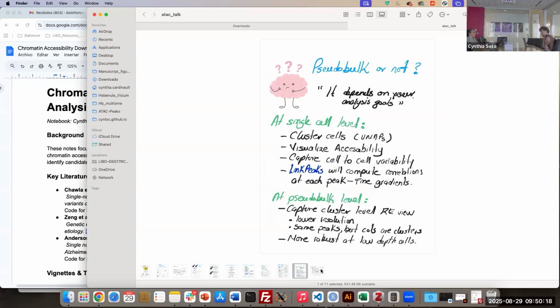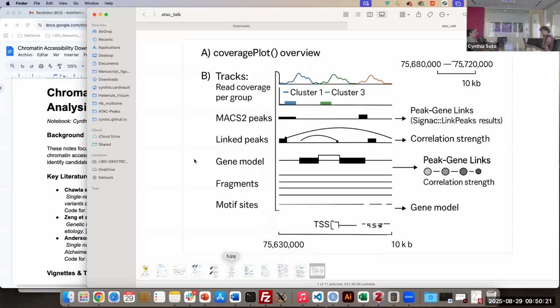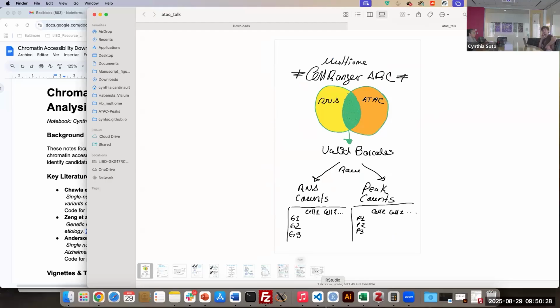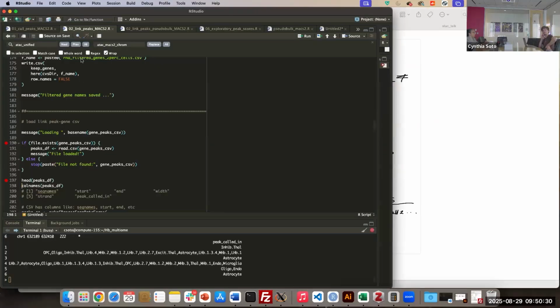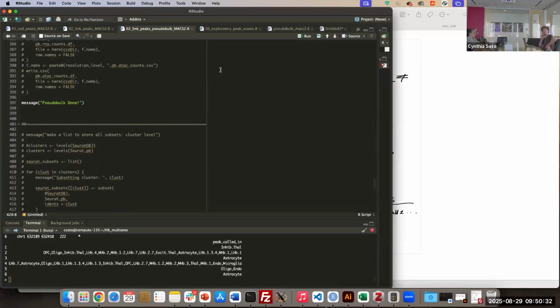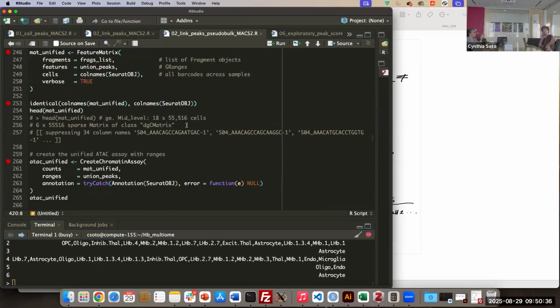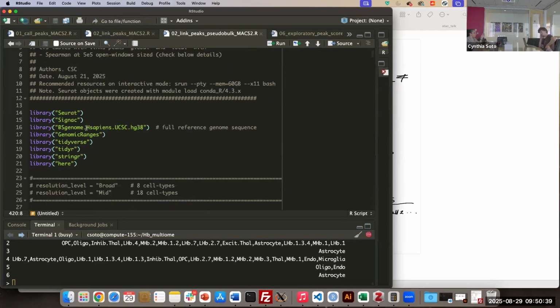It depends on a lot of things. So this is indeed, as you can see, a very conceptual approach. I'm just going to very fast explain one script in 5 minutes, just to point out specific steps. So we need CellRanger, we need Signac, we need the genome reference, and we need the GenomicRanges package to run reduce, and that's it.